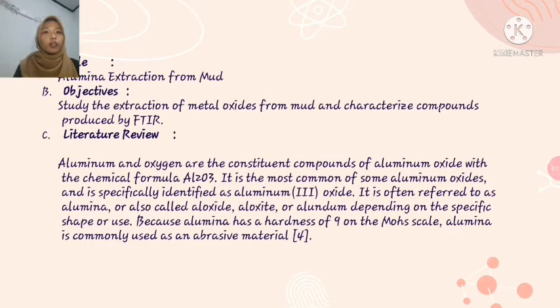Title: Alumina extraction from mud. Objective: study the extraction of metal oxide from mud and the characteristic compounds produced by FTIR.